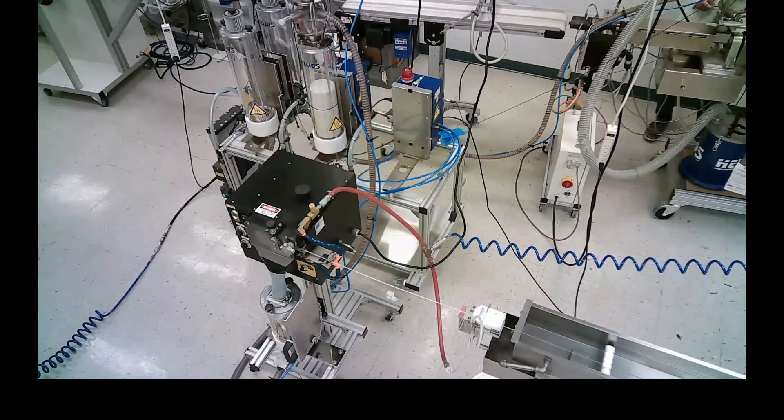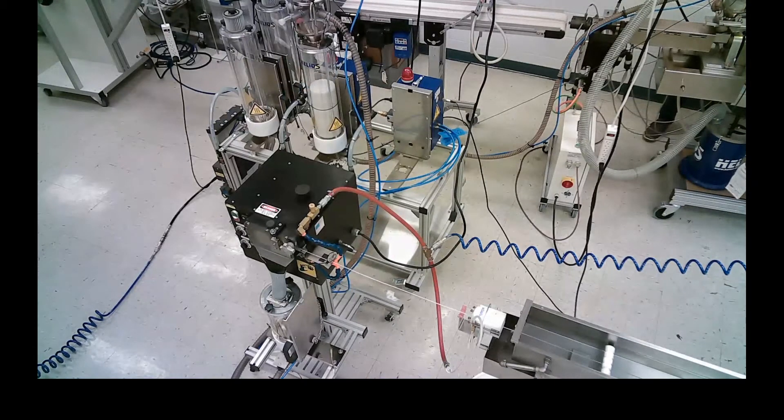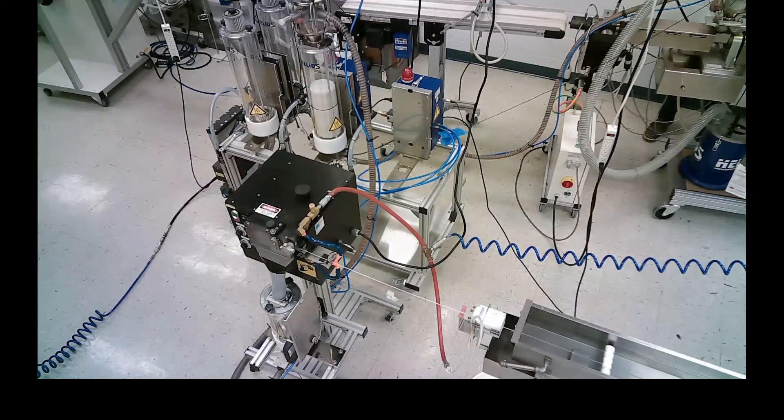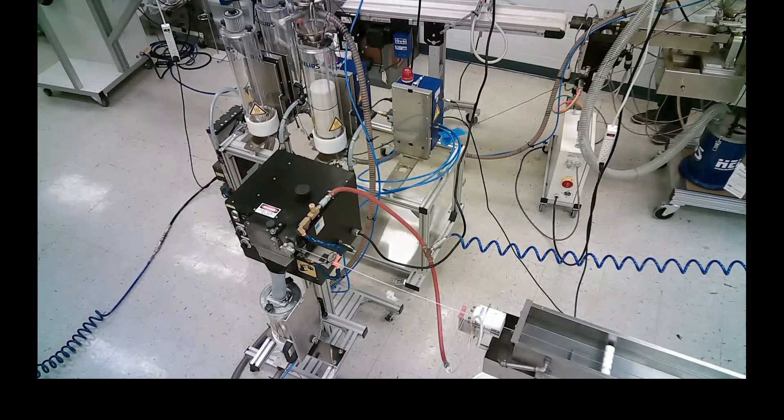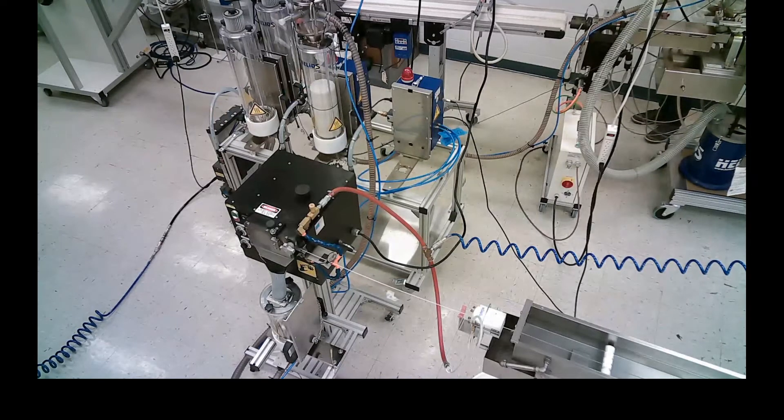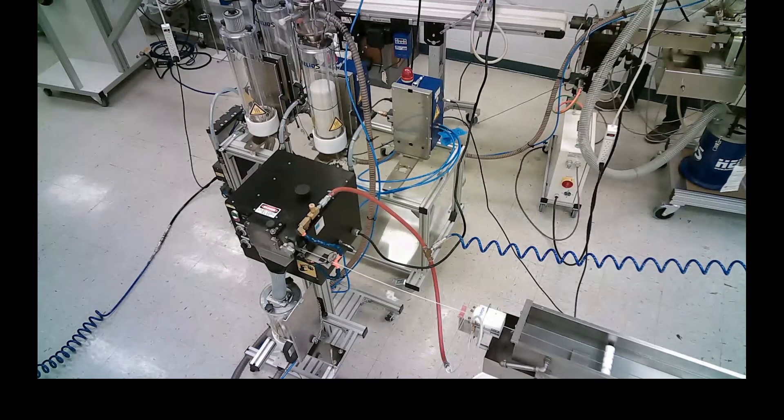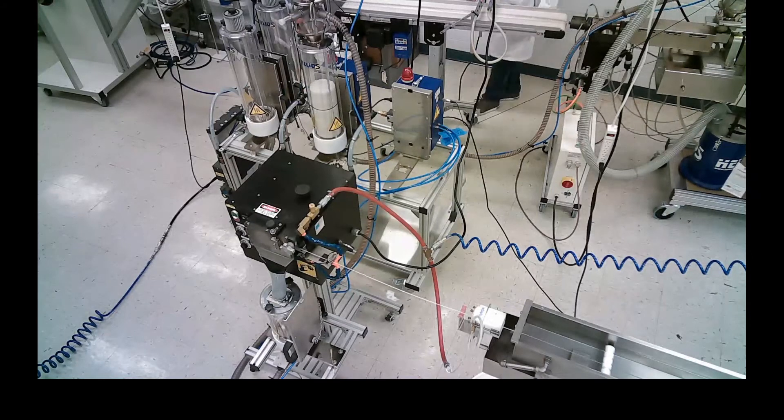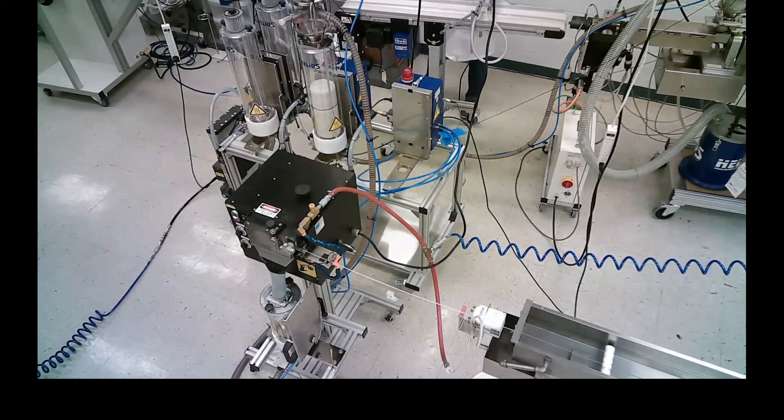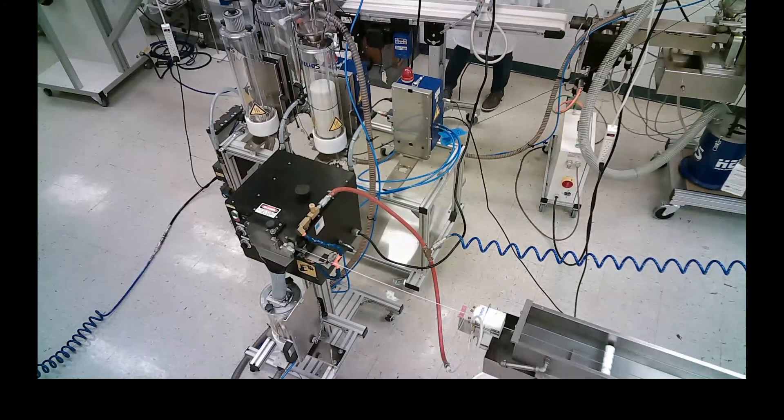We go to our pelletizer and this would be a typical compounding setup. As you can see from here on the pelletizer is then chopping the fibers or the filament into smaller pellets.